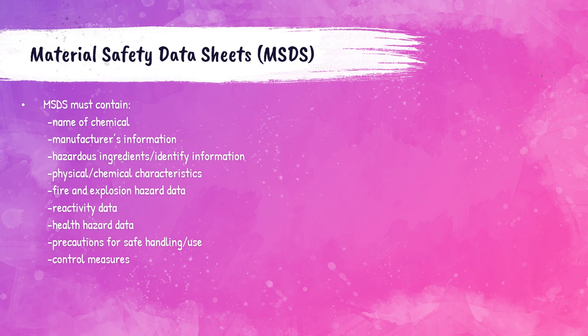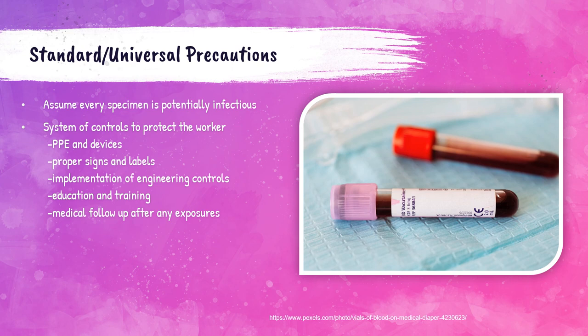Material Safety Data Sheets, or MSDS, are safety data sheets that list information relating to occupational safety and health for the use of various substances. The MSDS for each chemical must contain the name of the chemical and manufacturer information, hazardous ingredients, physical and chemical characteristics, data on fire, explosion, reactivity and health hazards, and control measures including precautions for safe handling and use.